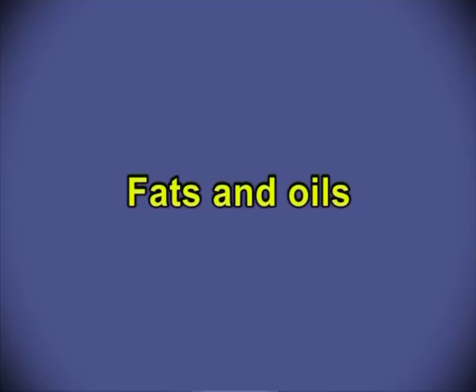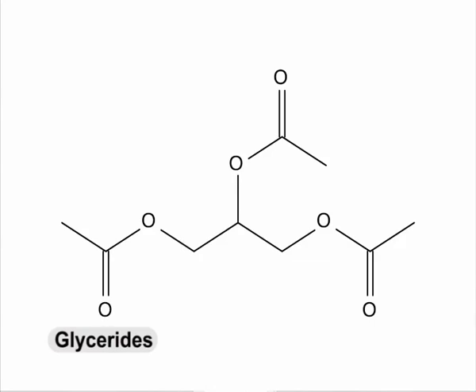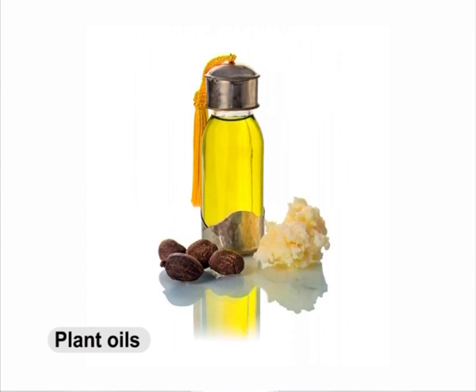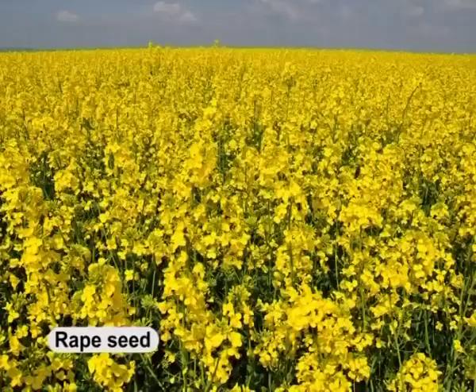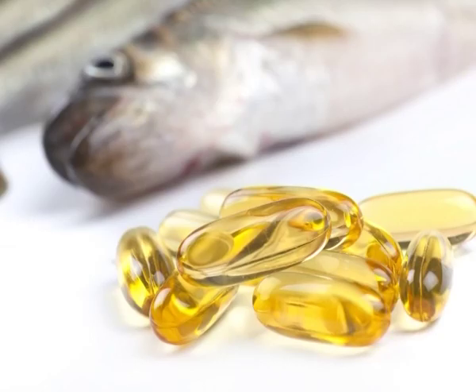Fats and oils. Hard animal fats that are mostly composed of glycerides of palmitic and stearic acids are rarely used in fermentation. However, plant oils primarily from cottonseed, linseed, maize, olive, palm, rapeseed and soya, and occasionally fish oil may be used as the primary or supplementary carbon source.